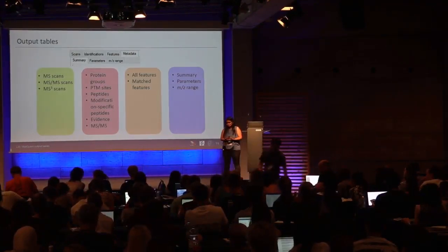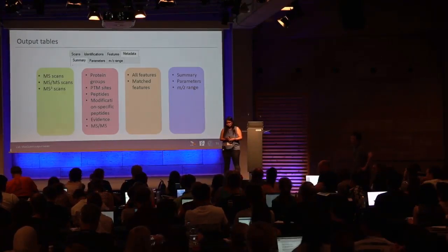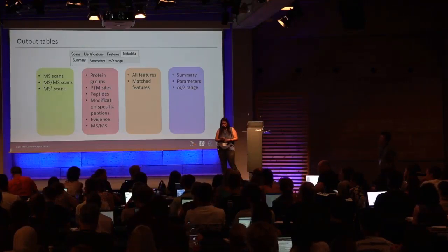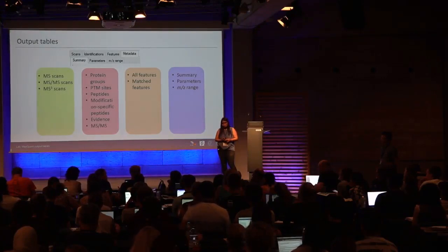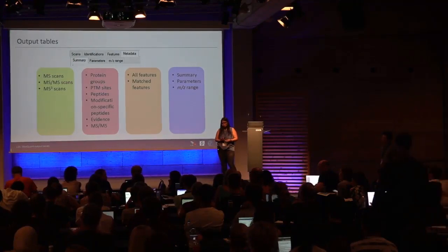Yeah, I talked to Professor Cox about this before, but there are many output tables. And I wonder, since there are so many already, couldn't you include some information about the non-normalized LFQ intensities? The reason I'm asking is that I'm always normalizing, but I've done a multi-dimensional scaling plot after normalizing, and I can still see some batch effects among my samples, which ideally should be normalized away.